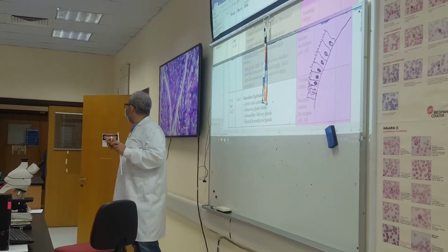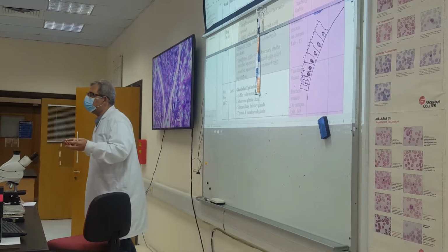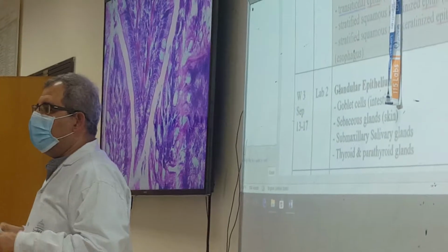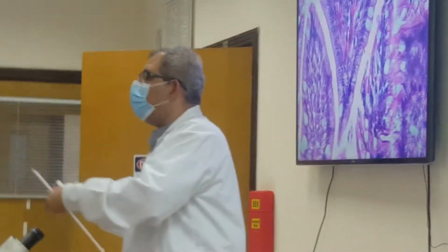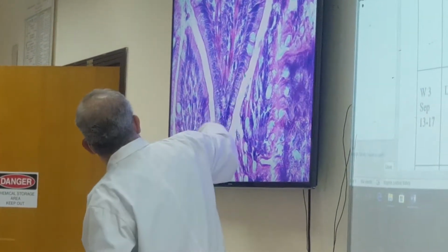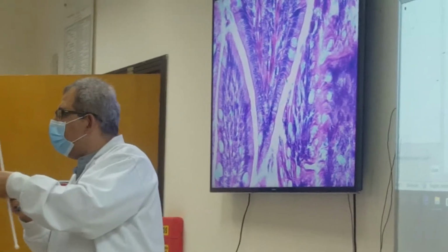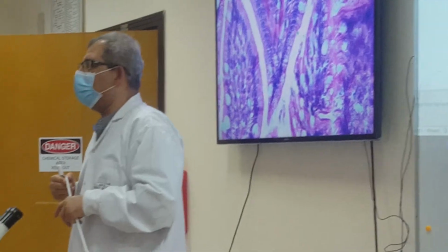And the material that they are secreting is a mucus material. So if you look here, it's sort of mucoid material. With the preparation of the slides, we add some things to prepare the tissue, so this material got lost in the preparation. That's why they usually appear as empty areas. This will lead us to a type of epithelium that works as secretory epithelium, secreting material.